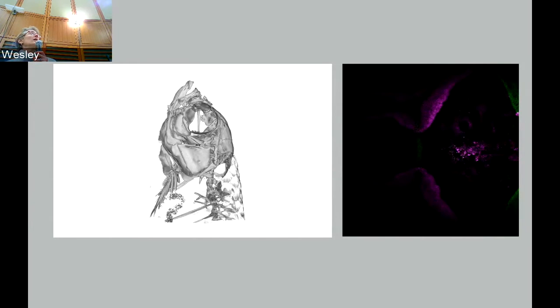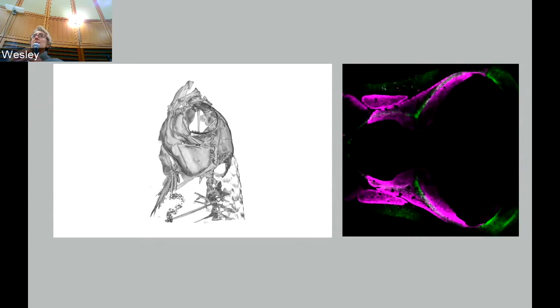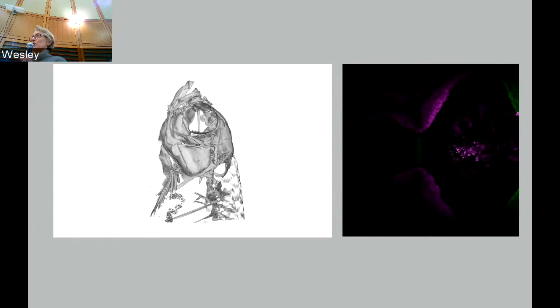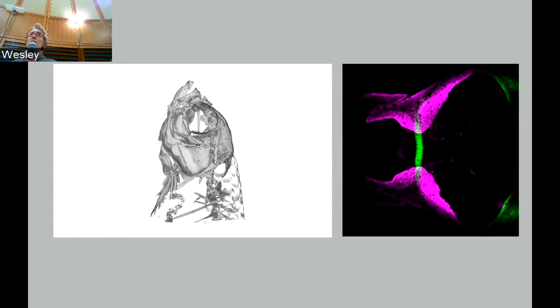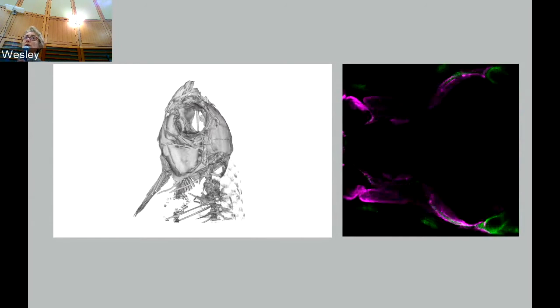And one thing that I want to point out about our confocal data sets, we focused on providing fairly complete sets of scans at different time points of the same individual fish. So, a user can go onto the website and basically download this imaging data over a period of a couple weeks or longer for a single individual.